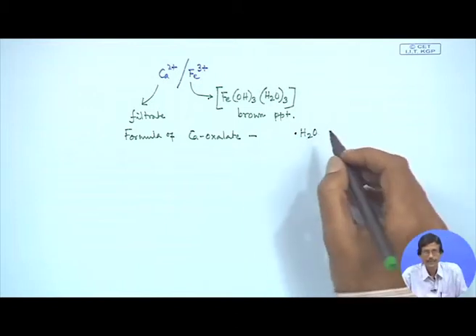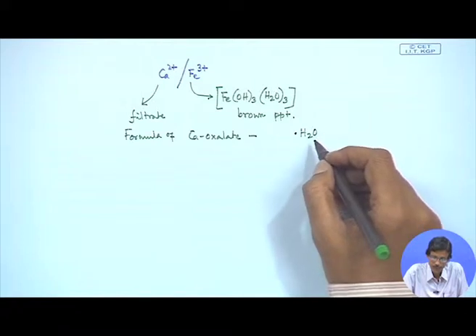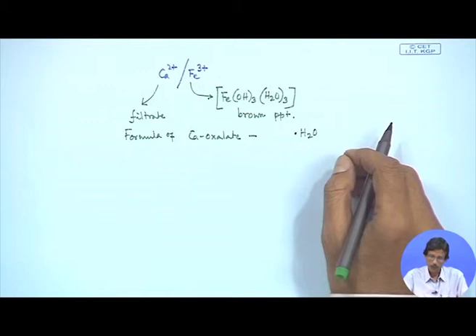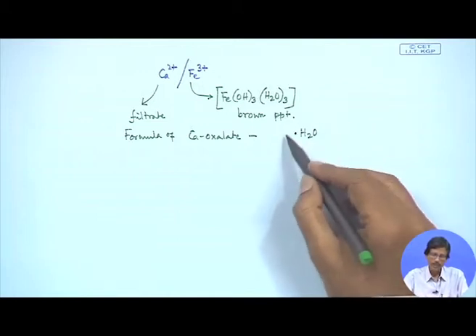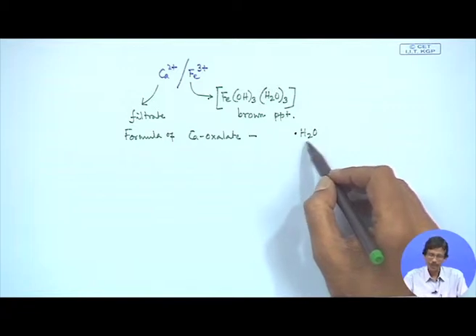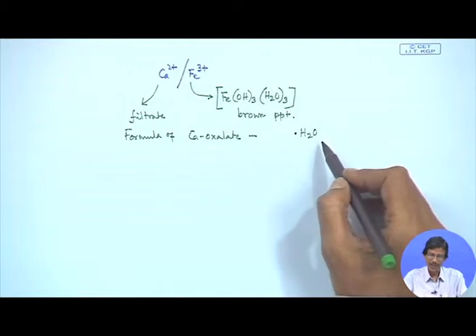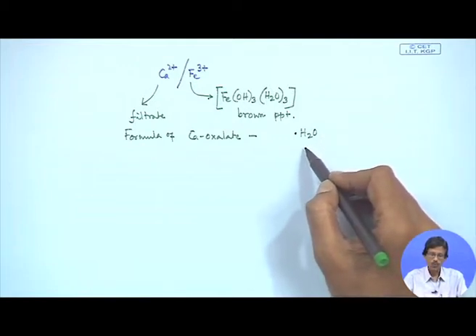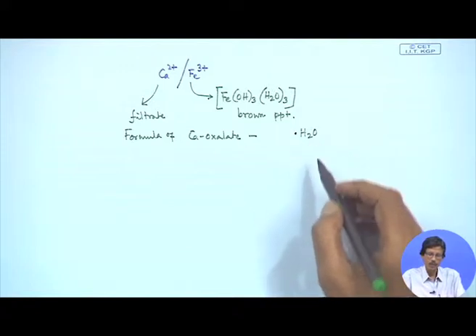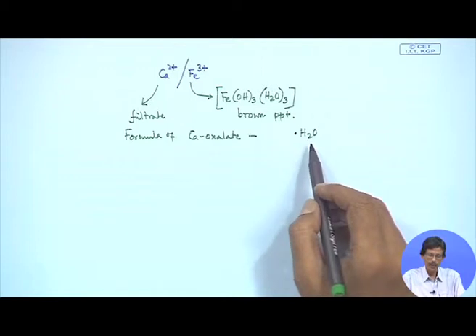molecules present as water of crystallization is also very important to study, because we have seen that two types of sodium carbonate we can have. The washing soda, when freshly precipitated or freshly prepared sodium carbonate we have, it has 10 water of crystallizations, but if we keep it for longer period even in air, it can lose 9 other water of crystallizations and it remains with that of your monohydrate species, that means sodium carbonate monohydrate.